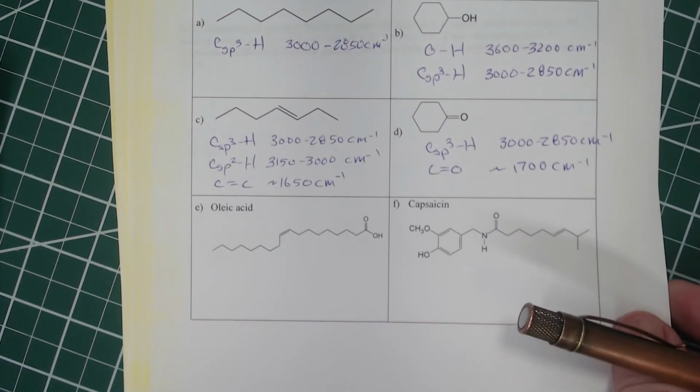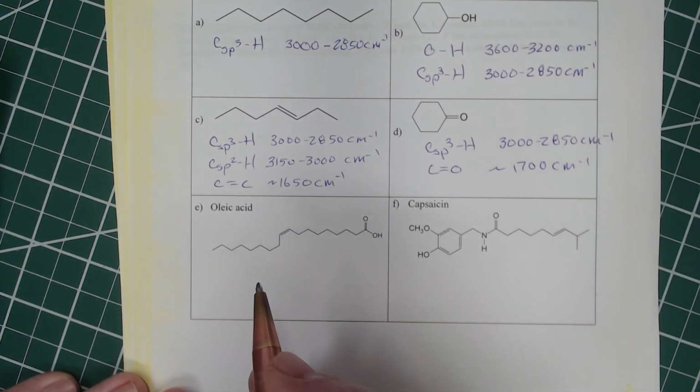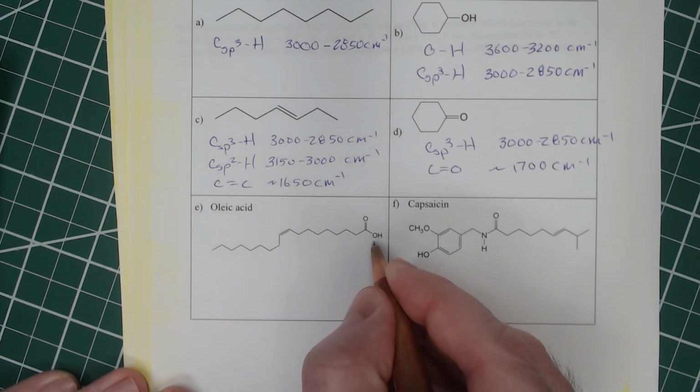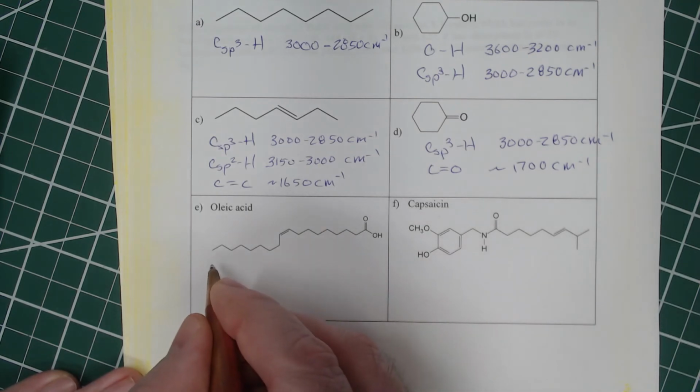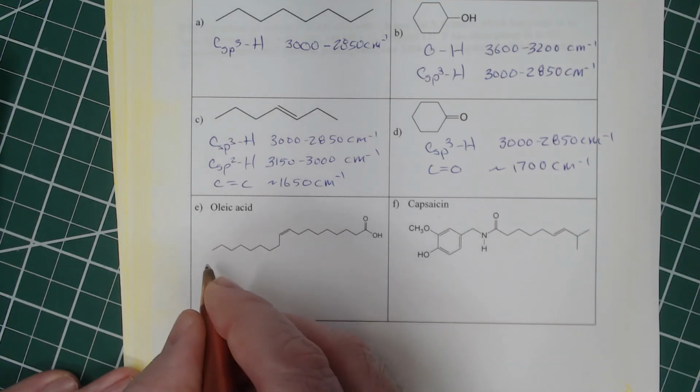All right, so for this next one, we've got oleic acid. There's multiple things here to pay attention to. Let's go ahead and get the most prominent thing, the OH, which is for the carboxylic acid. And as you recall, it is much, much broader than regular alcohol OHs.